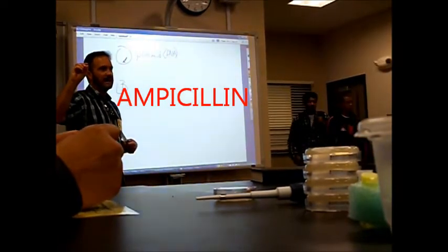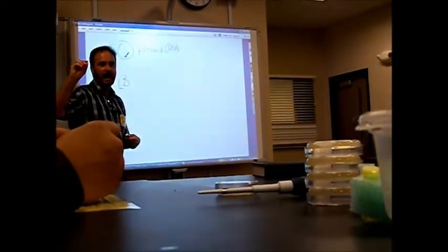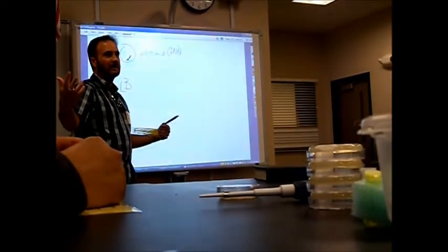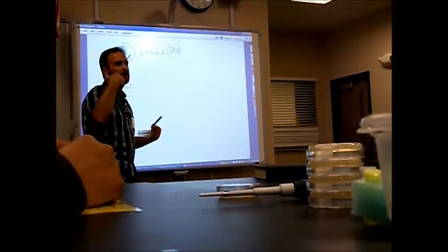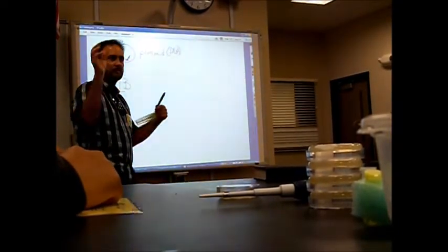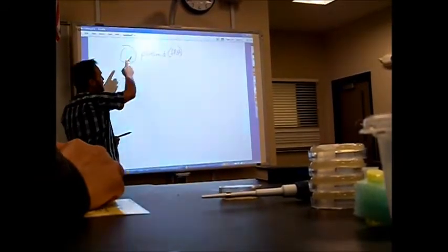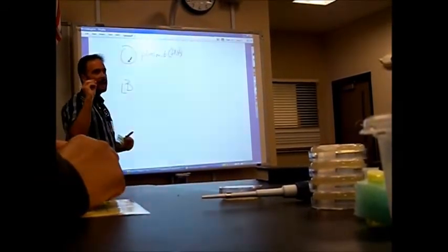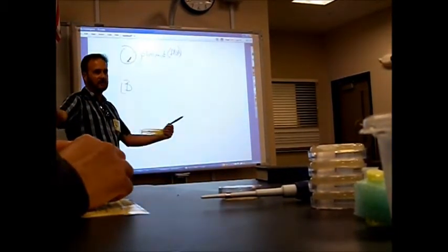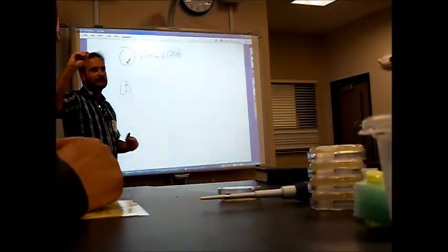It's an antibiotic. What do antibiotics do? They kill bacteria, right? So if you just took regular old bacteria and you put them on ampicillin, they're going to die, right? Like you take an antibiotic if you have a bacterial infection, that gets rid of the bacteria. So in this case, if you took these living bacteria and just put them in regular ampicillin, you'd expect them to die. But if they have this little super ring of DNA here, they have a little piece of DNA that basically tells them how to live in poison. Isn't that cool?